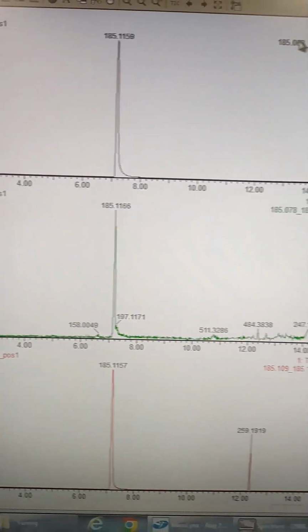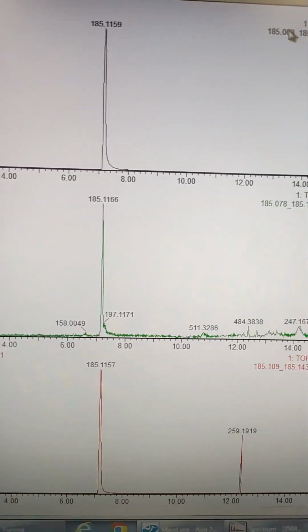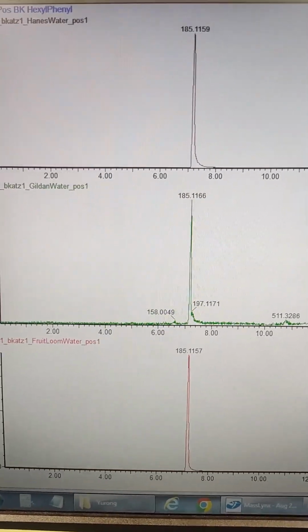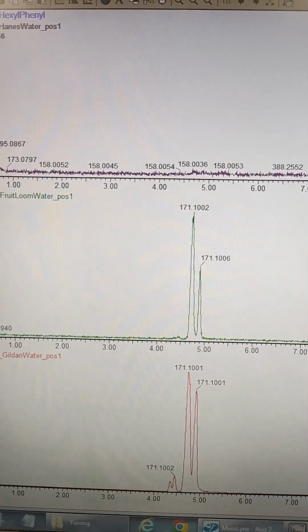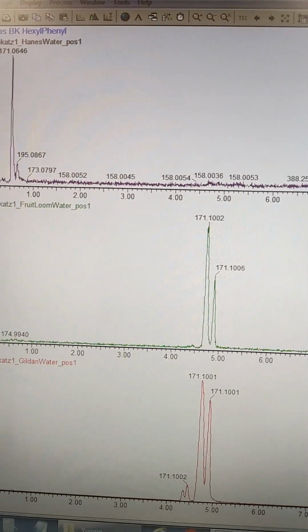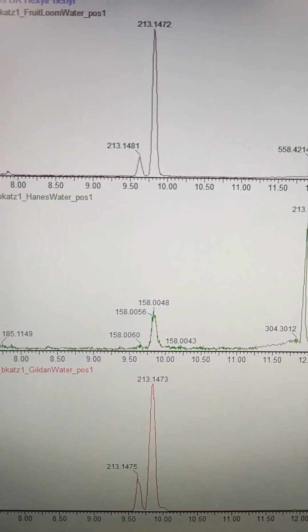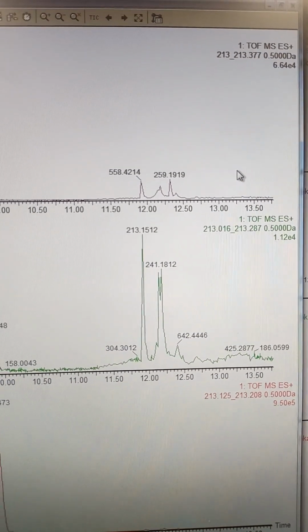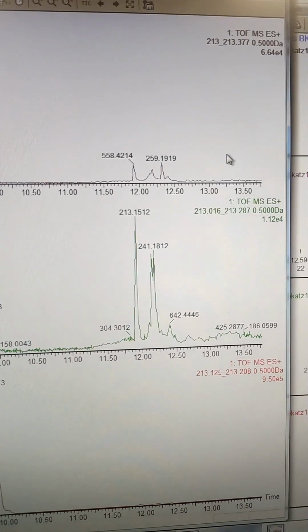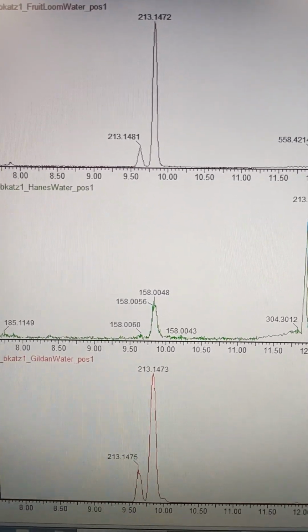So if we look at the EIC for the 185 mass, you can see that we're E to the 6 in both the Hanes and the Fruit of the Loom, but there's almost none in the Gildan. So 185 is just in everything but the Gildan. The 171 mass, that doublet, really strange, is mainly in the Gildan, a teeny bit, maybe carryover in the Fruit of the Loom, none in the Hanes, nothing. The last mystery mass, the 213 mass, another kind of weird doublet, is really intense in the Gildan. It's still in the Fruit of the Loom for sure, not as intense, basically not even in the Hanes. So there you go. Let's try to figure out what these are.